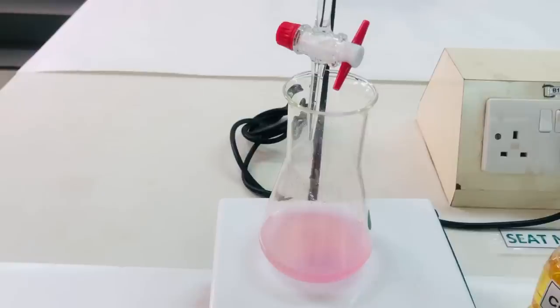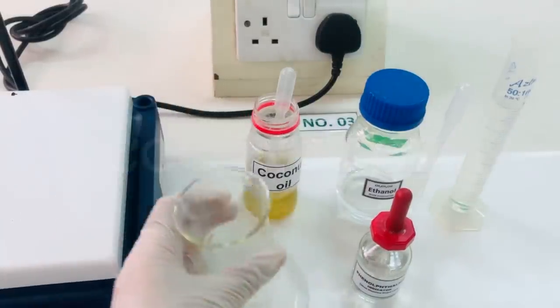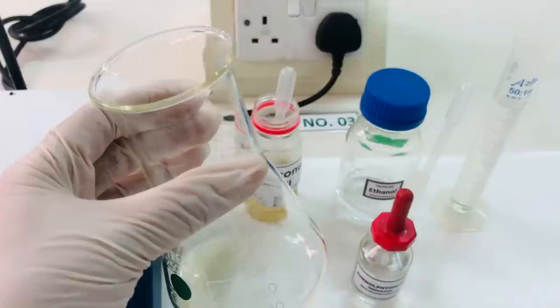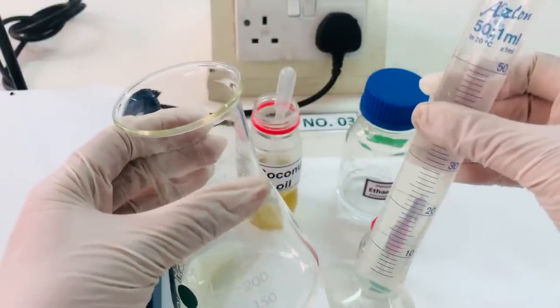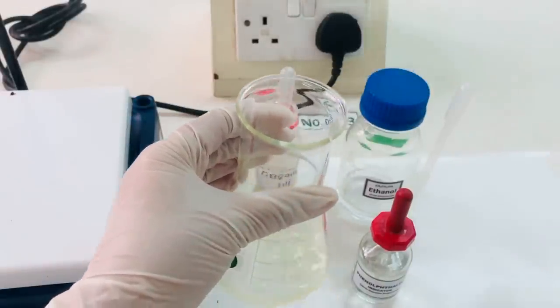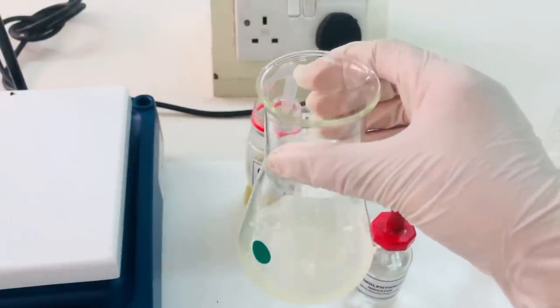for the calculation. Another sample that we have taken for today's experiment is coconut oil. To this coconut oil sample, we will add 50 ml of neutralized solvent, which is ethanol, neutralized ethanol in our case. Now we are going to place this mixture on the hot plate.